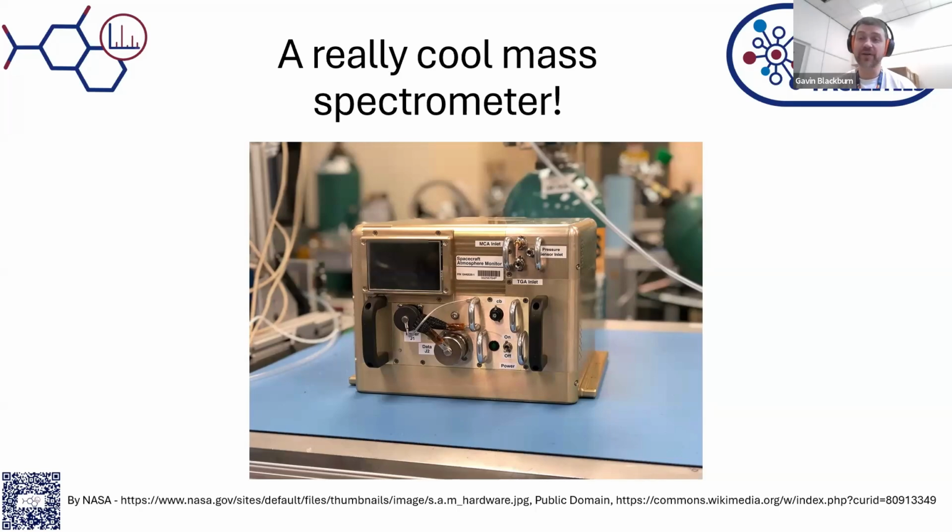And if you can put a mass spec on the International Space Station, you can put a mass spec on anything you put into space. So there's already discussions about being able to fit these kinds of instruments onto, say, the Mars rover or something else that you are sending off to planets. And then you can start getting real data that comes out, because the great thing about mass spectrometry is it can identify compounds. You can get that information back from them, and lots of other analytical techniques that we apply that are really useful, you can't do that with.